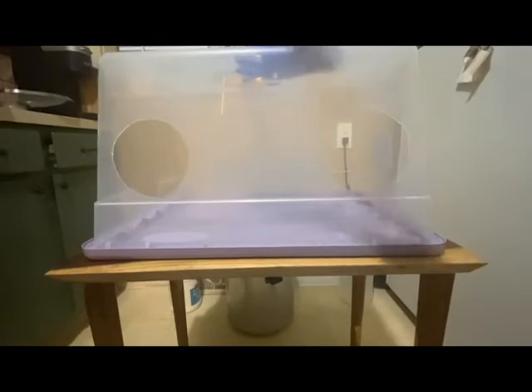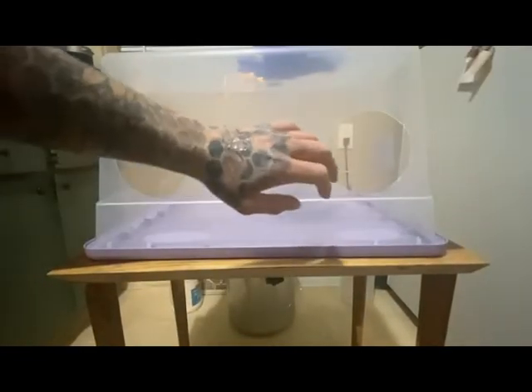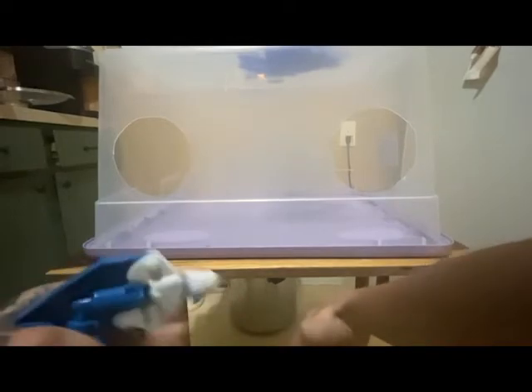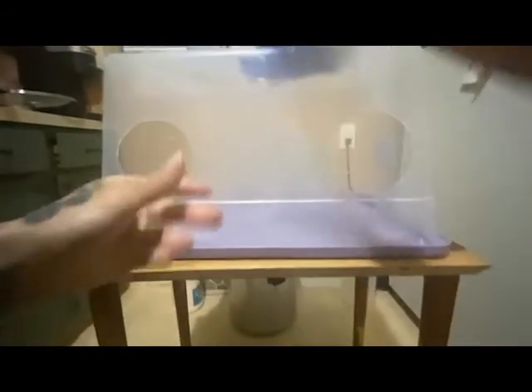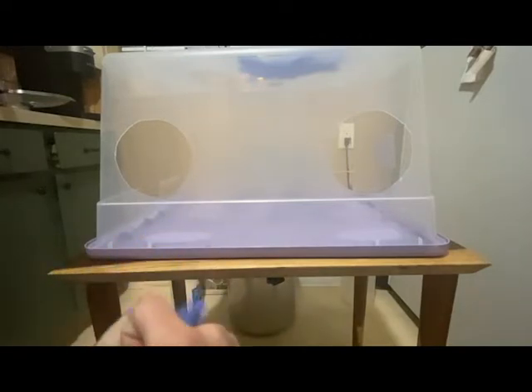Now, for the fun part, first thing we do is spray some isopropyl alcohol all over the arms. Get some gloves on.